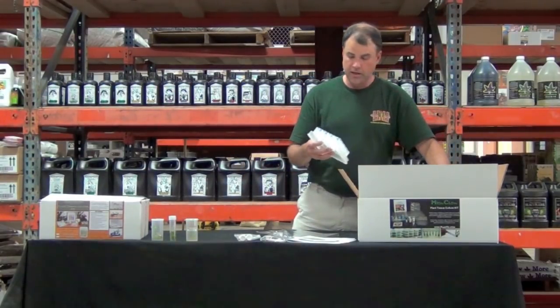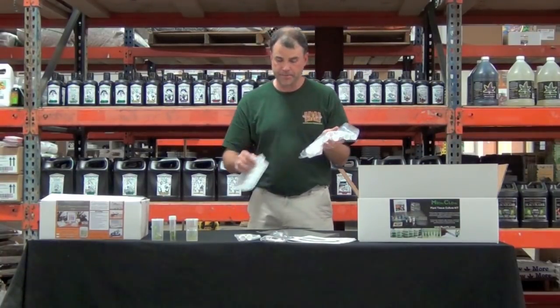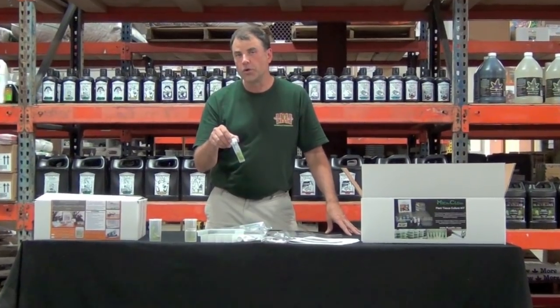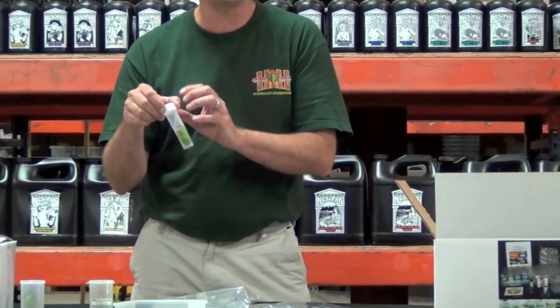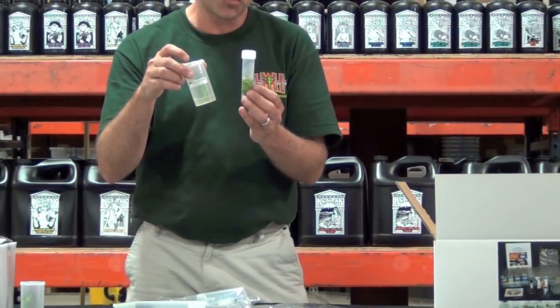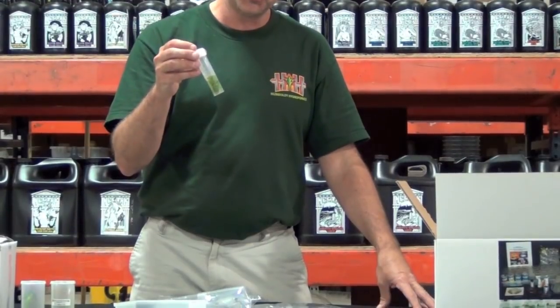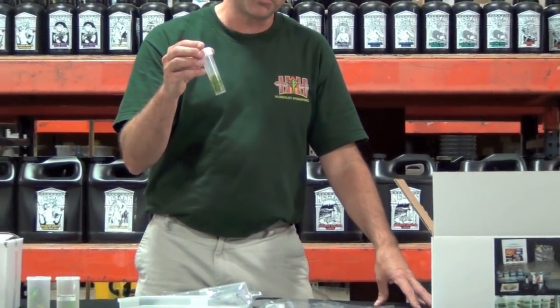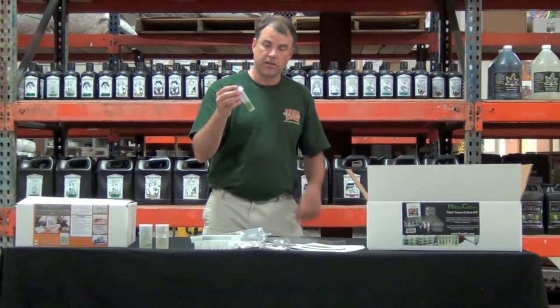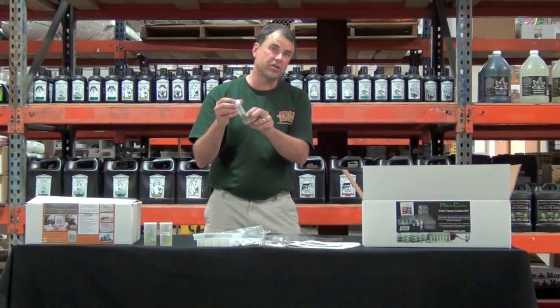The kit will also come with a rack and 18 polypropylene tubes with screw tops. The tubes are nice for the first time you're putting plants in tissue culture because we can make two of these for every one of these — this is 10 milliliters of medium, this is 20. These vessels are also nice if you're trading plants or shipping plants. This is the tube that ships well if you put it in an envelope or a package and send it without light for a few days. The medium holds well to the narrow walls, with a lot of surface area contact.